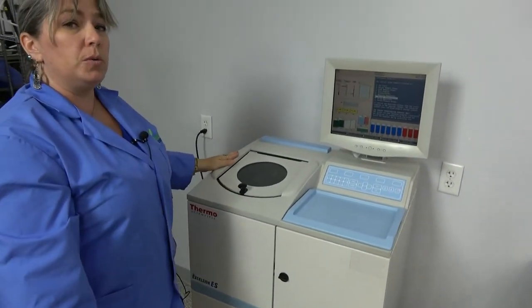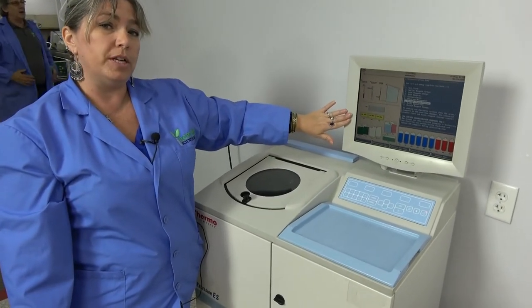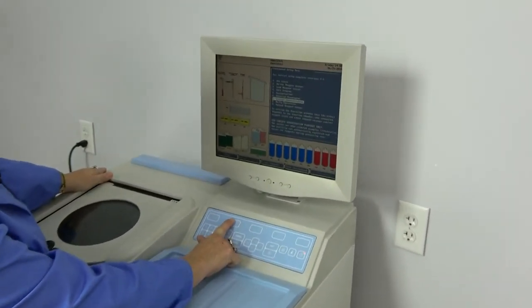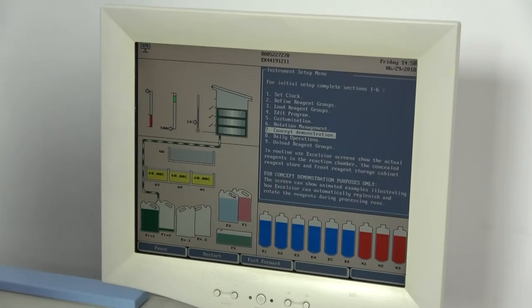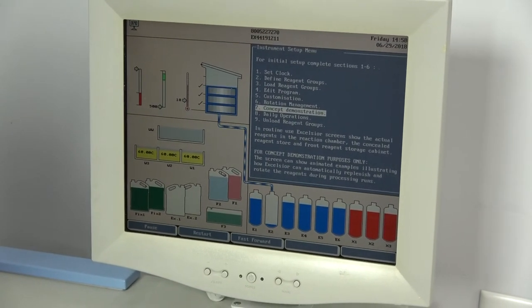Because we don't have it loaded with the reagents right now, we want to run it through a demonstration so you can see how well the graphics work on this particular unit. We're going to run a demo and we'll put it on fast-forward. As you can see, it's very visually friendly so you can keep an eye on your processes.